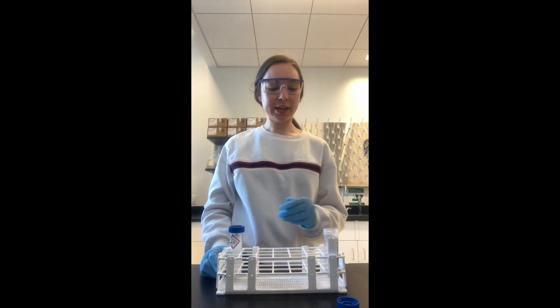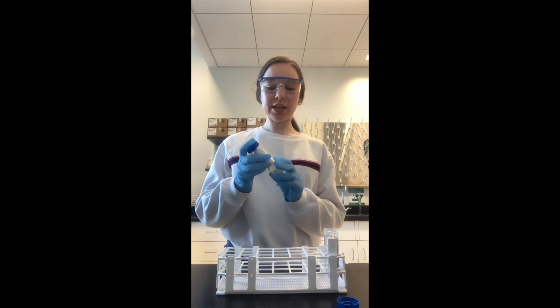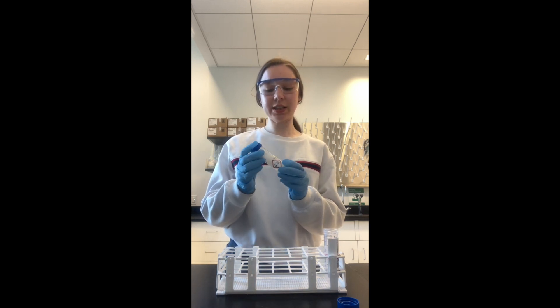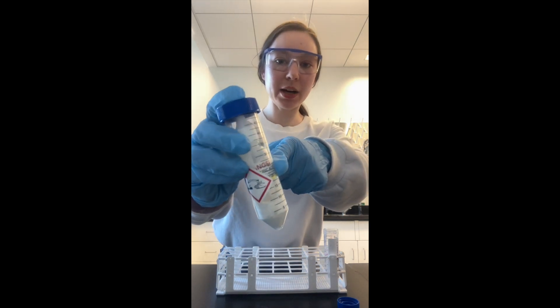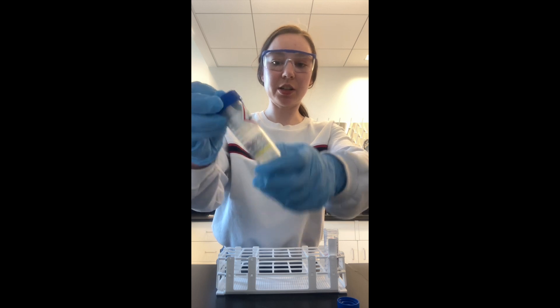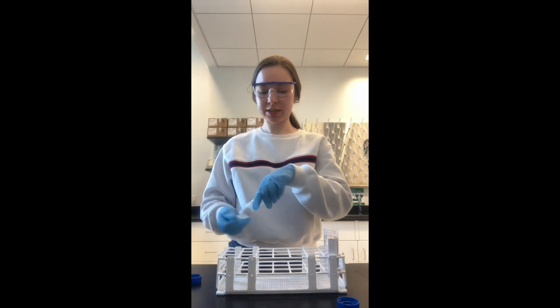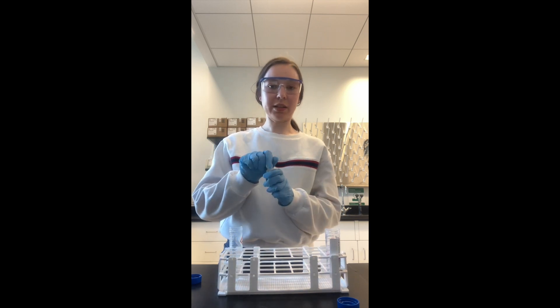Once your samples are all ready to go, lined up and uncapped, you're going to take your acid. As you'll see, it is in two different containers: an acid dropper bottle inside a secondary container with all the proper safety warnings. You're then going to uncap the secondary container, remove the acid dropper bottle, and uncap that.